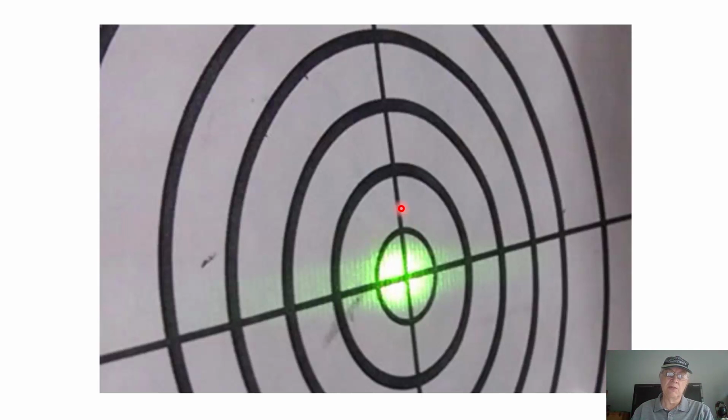The pin is aligned vertically, and that is why the scattering pattern, or the diffraction pattern, extends to the left or to the right horizontally. And the other thing is that if we were to replace the pin that we have now with a thinner pin, these vertical stripes that you see here would get farther out. And if we were to replace it with a fatter pin, they would collapse even closer to the center. So this business about being an inverse scattering method is important.